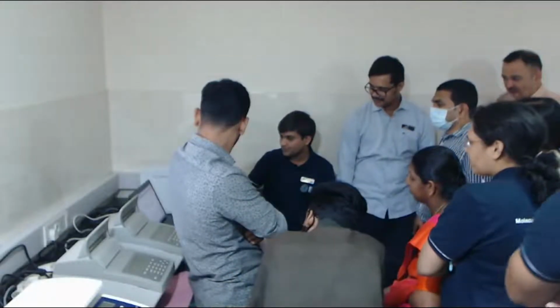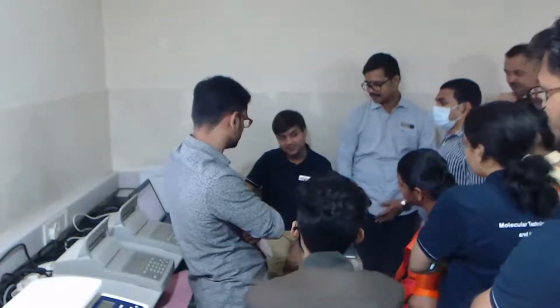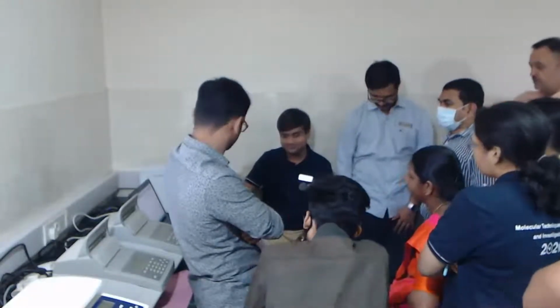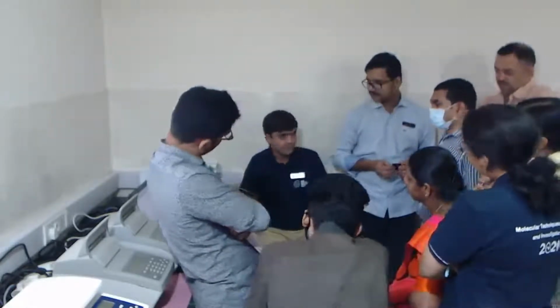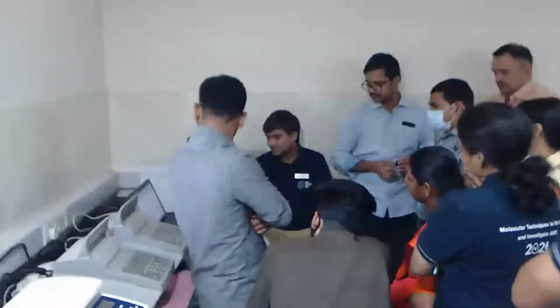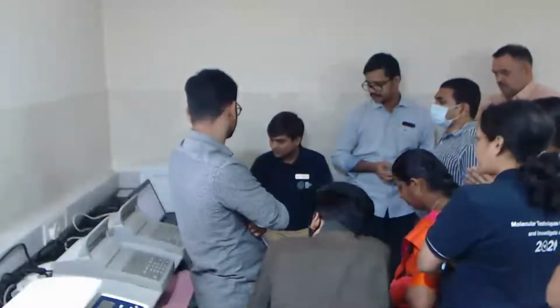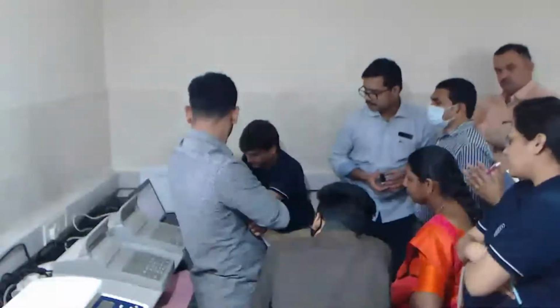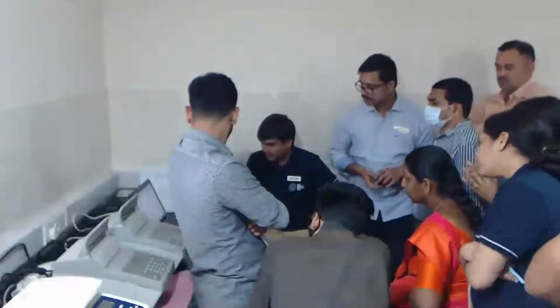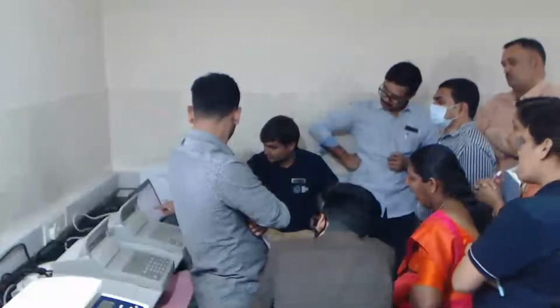So now what we are going to do is, since there are multiple fragments of different lengths, we are going to take an average size of the fragments. Okay. So we had all those samples. Even we can look at it this way. These are all the fragments overlaid on each other. So you will be able to see a few of those peaks.